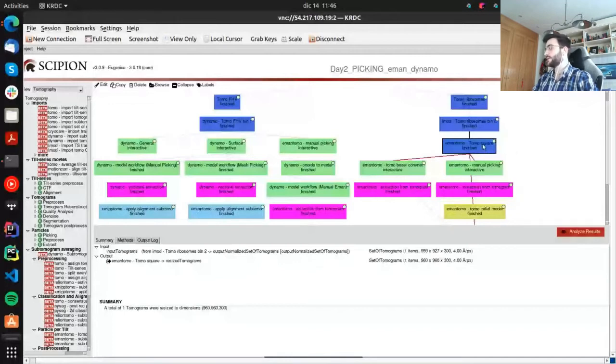And we also offer the stable versions. The problem is that the stable versions usually don't like rectangular tomograms. They like the tomograms to have the same dimension in X and Y, and this is the case for the picking we are going to use. For today, it's not going to be needed because we are working with the very latest version of Eman. But if you see any error there and you decide to install the stable version, just remember that you probably need to make your tomograms square before picking them. Then we have ways to go back to rectangular tomograms with the coordinates and so on in Scipion, so it's not a problem. This is just a small clarification.